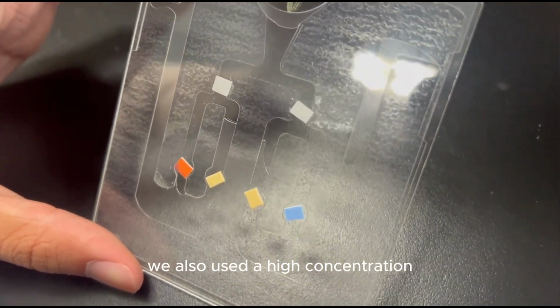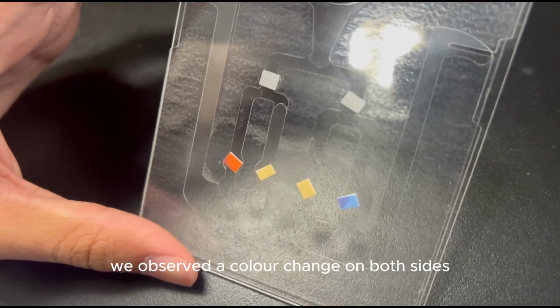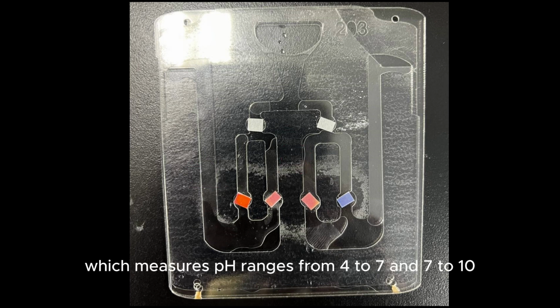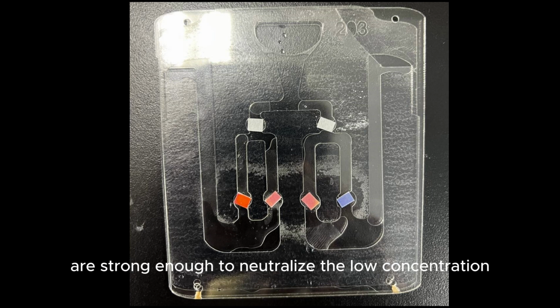In our last experiment, we decided to use a low concentration acid throughout the entire process. We also used a high concentration carbonate on the right side and a low concentration base on the left side. We observed a color change on both sides. For the pH testing on the left side, we used pH papers 2 and 3, which measure pH ranges from 4 to 7 and 7 to 10 respectively. Both of these papers changed color, indicating that the pH of the solution on the left side was around 6 to 7. This suggests that the low concentration base was strong enough to neutralize the low concentration acid.